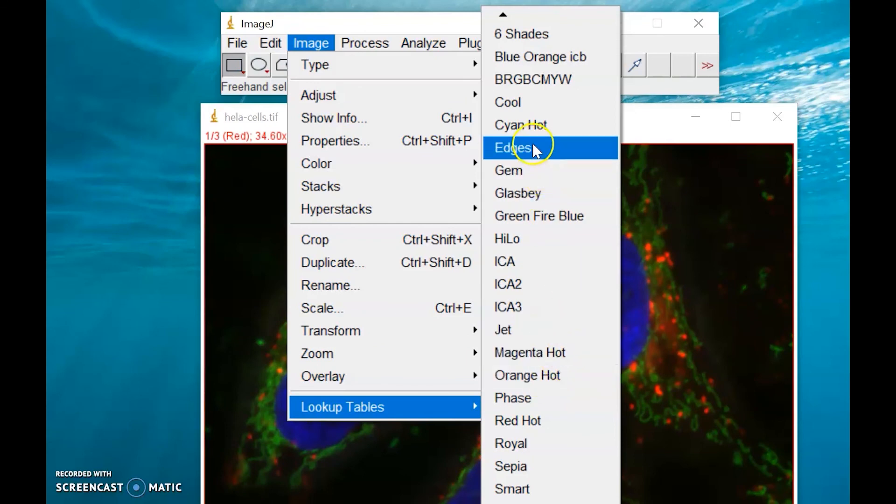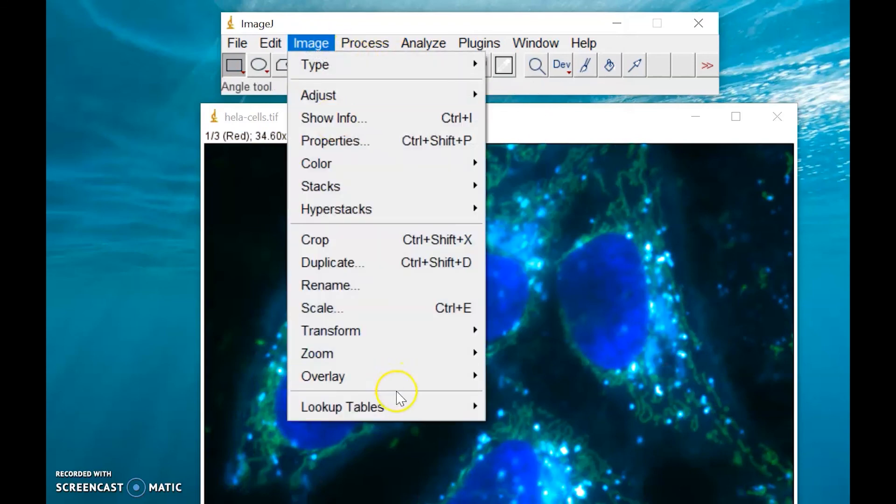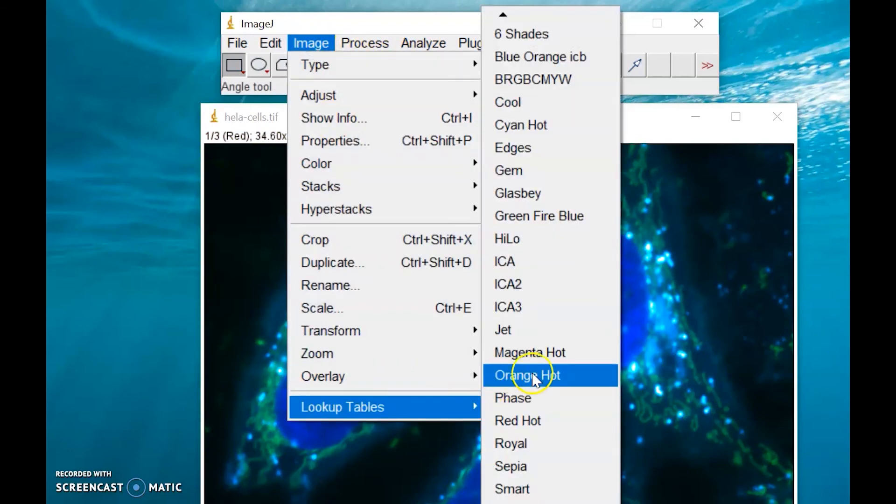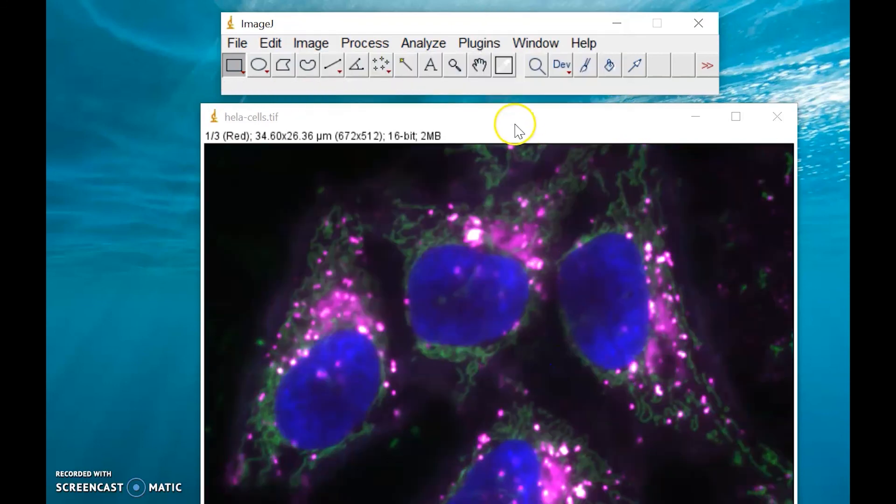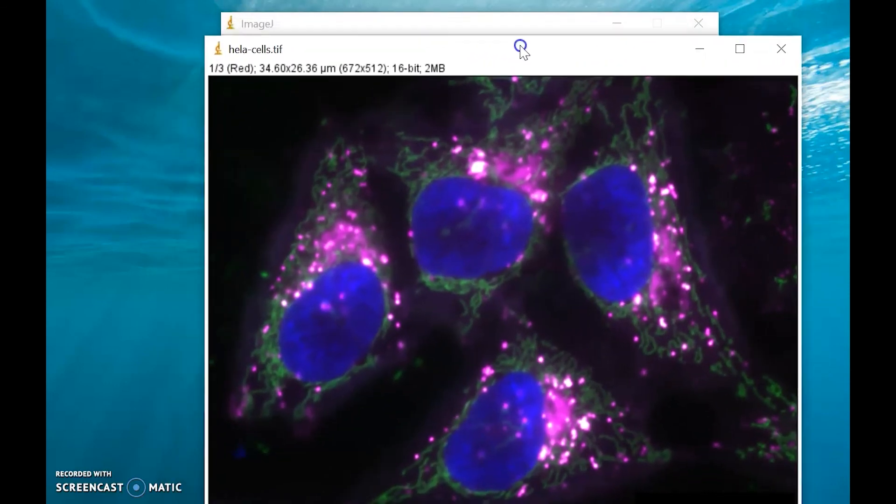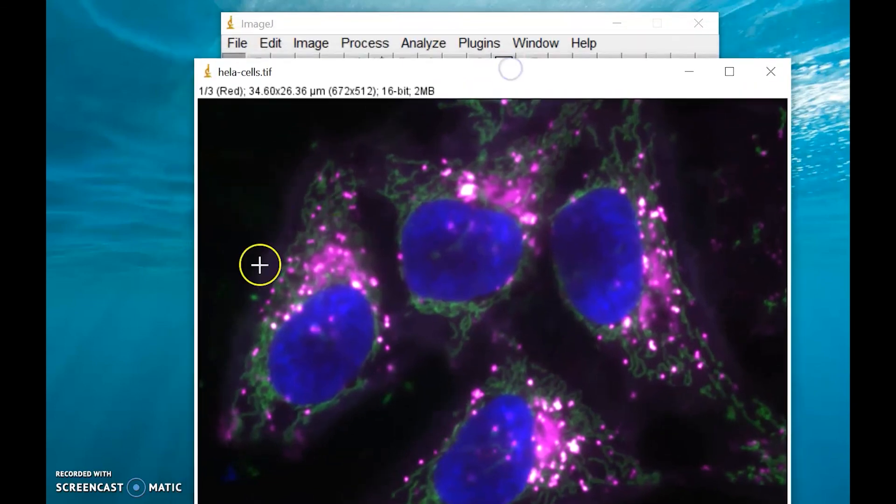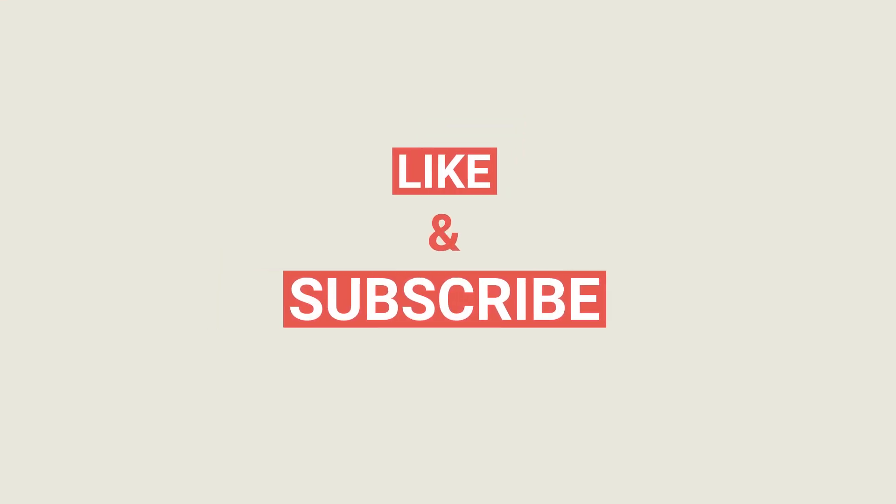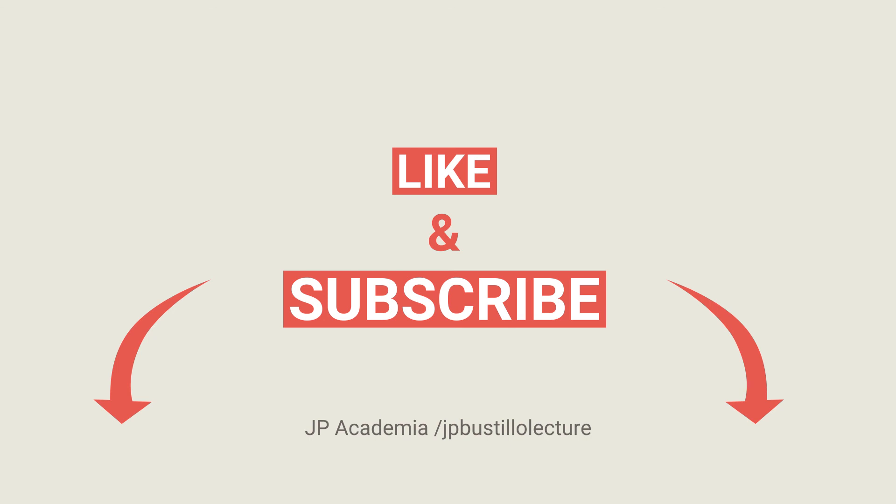Let's try cyan, or let's try other lookup table, like Magenta. So there you go. That's how you change the lookup table of your image sample.